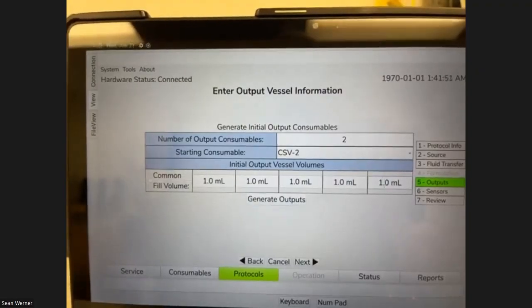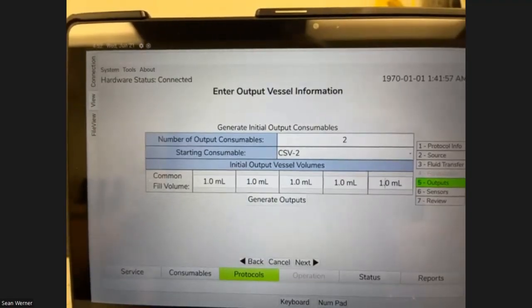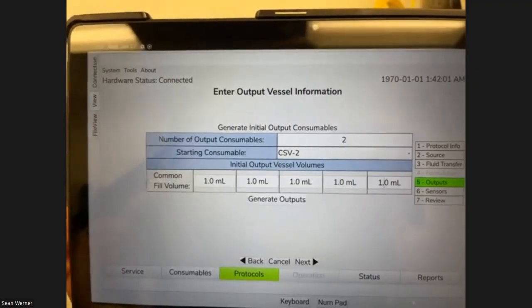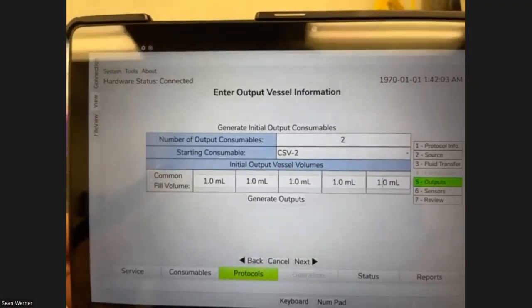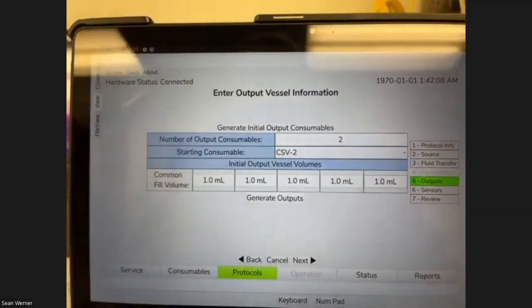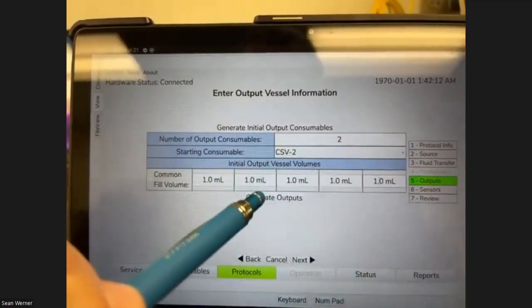We have the ability to go in remotely and we can have you collect data on the process, give us those values, and then we can give you an update to the constants for the flow factor calculation. But it doesn't really need calibration on a regular basis.